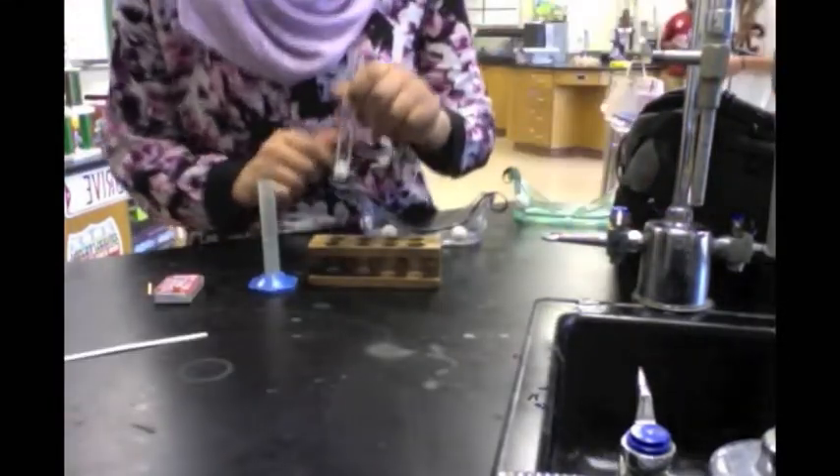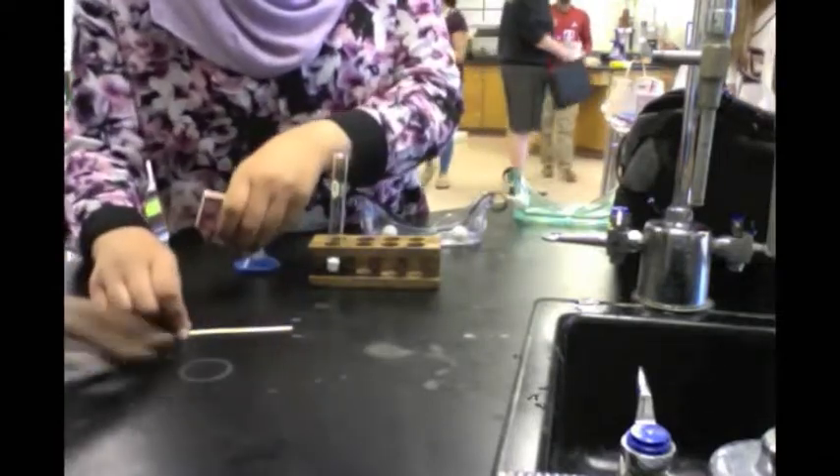For this experiment, we are going to start by filling the beaker with water so we can put out the match after the wooden splint is lit. In the test tube, we have calcium carbonate prepared. In the graduate, we have lime water, a wooden splint, and matches. We are going to take the wooden splint and light it.